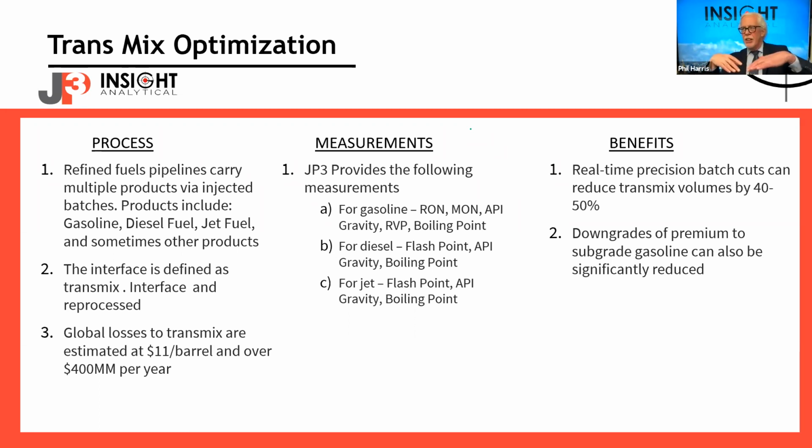It changes my baseline. It doesn't affect my spectral shape that much. That's why we do all this pre-processing, to get rid of baselines and all the things we don't want to see. So chromatographs, online vapor pressure analyzers, viscosity, things like viscosity, Raman, a bunch of those physical property type things.